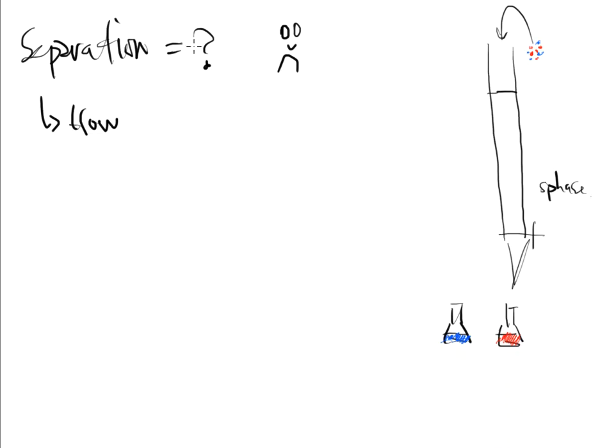Okay, so what is this made up story? Well, it's not fully made up, because what they call this is a theoretical, it already sounds wishy-washy. Theoretical? Give me a break. Theoretical plate theory. Okay, so what is this theoretical plate theory saying to us?